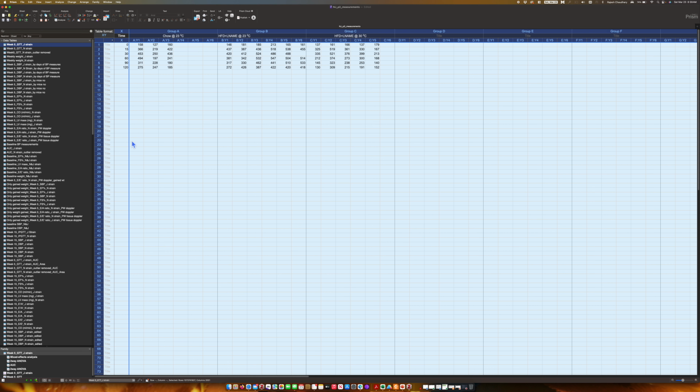So I'm just going to show you how it is done, where to go and what to click, and how to perform that, so that you can get a graph out of it and you can analyze your data to get the p-values for your groups.